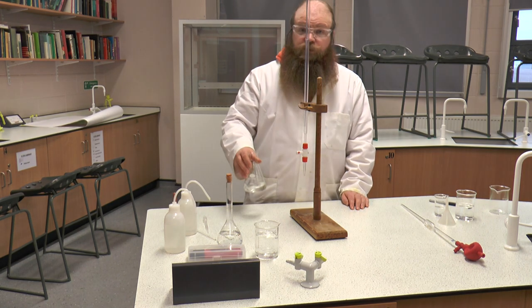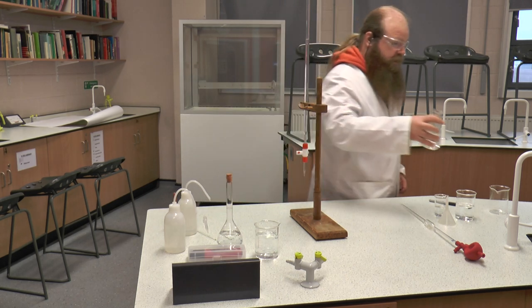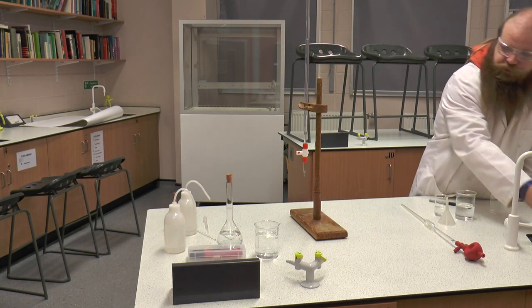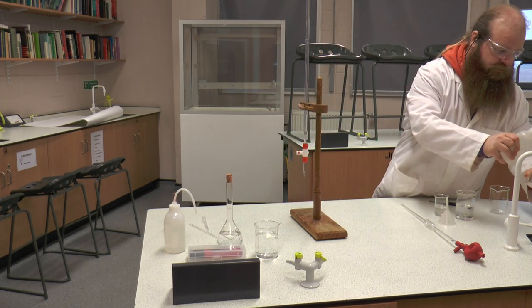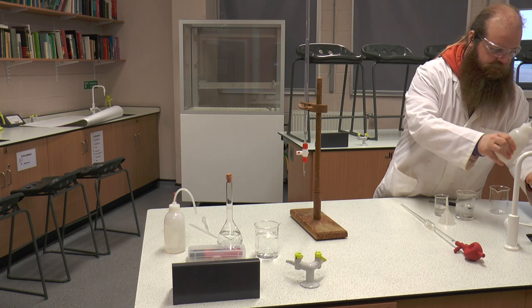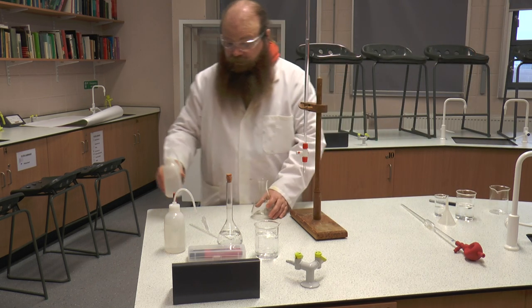And then what we would do is repeat this. We would take our flask, get rid of the excess solution, and then use distilled water to rinse out our flask to remove any traces of the last experiment, and then go through it again.